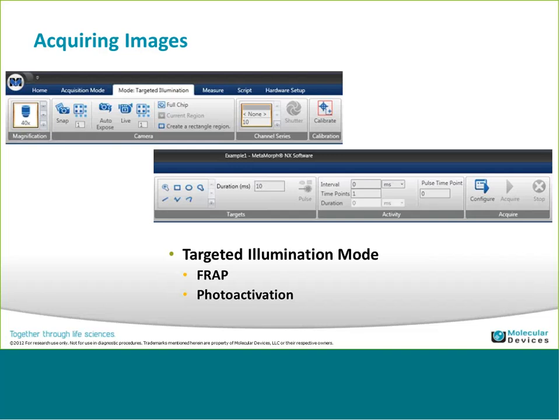So you set the magnification you want to use, you set the number of channels, and to add a channel, if you click on a box, you'll get the add channel option, which will add it to the list. You can also remove a channel here, so I can remove one or add one. Then when I get to the add, I come in and select it, and then I select the illumination setting.